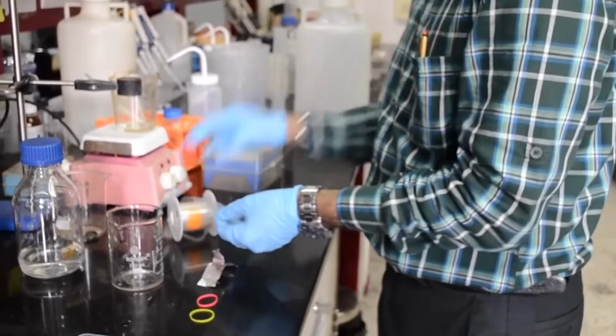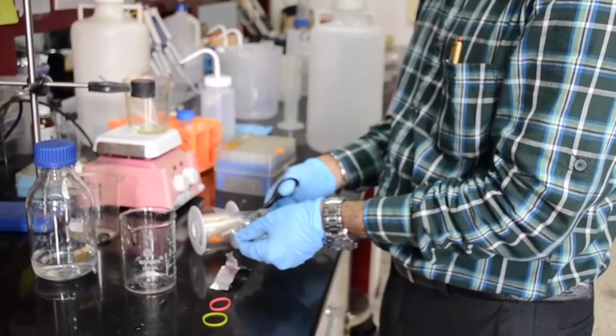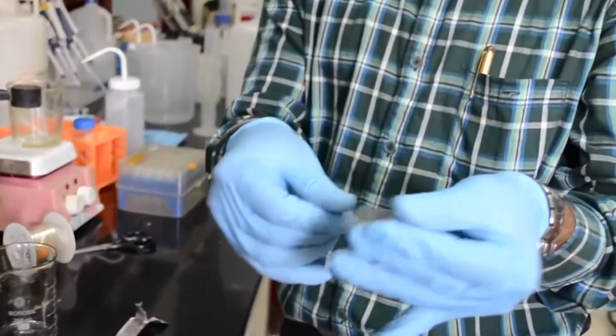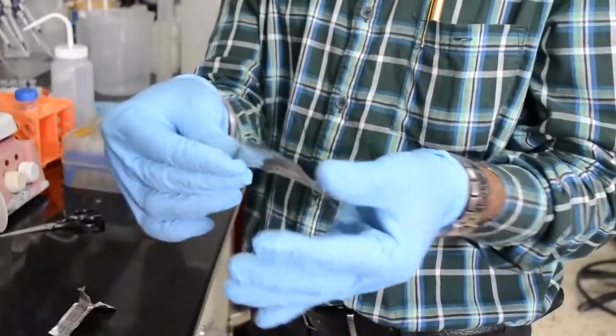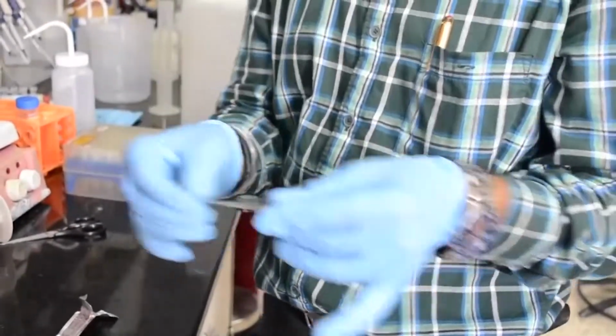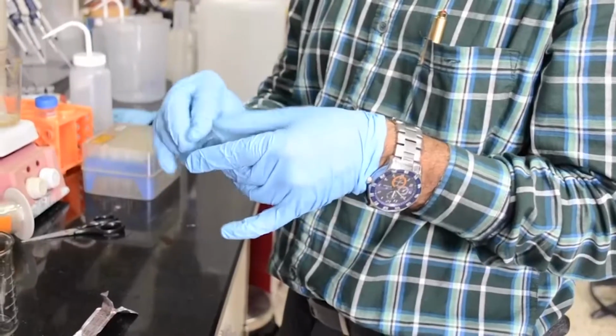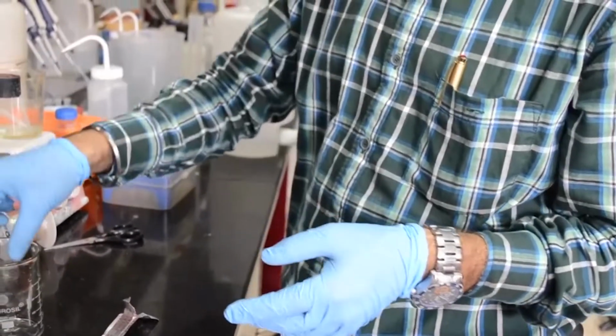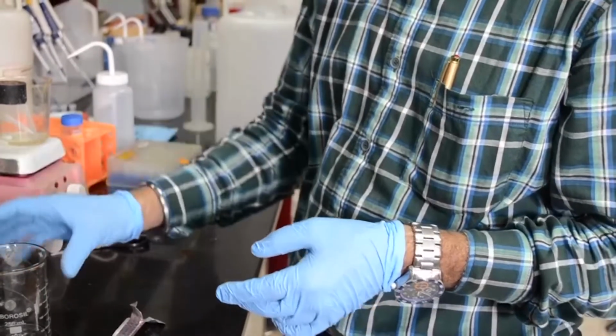Before you start, you have to cut the dialysis membrane, and what you can see is that both the ends are stuck to each other. To get this dialysis membrane into working condition, you put it into a beaker and fill the beaker with water.